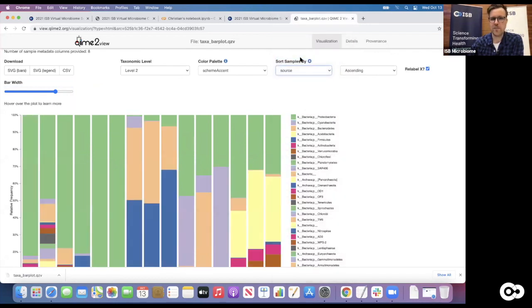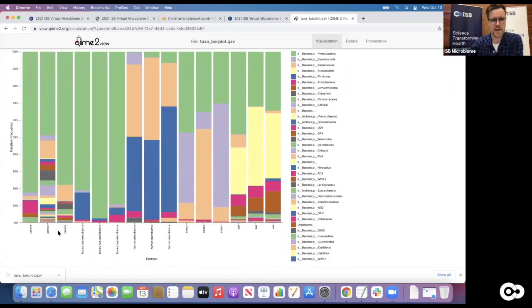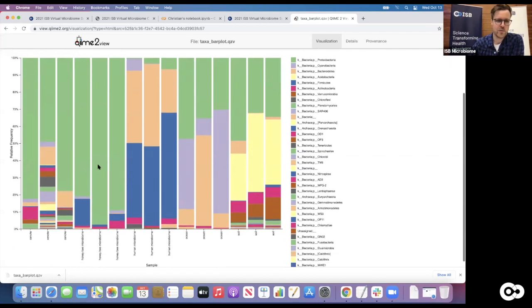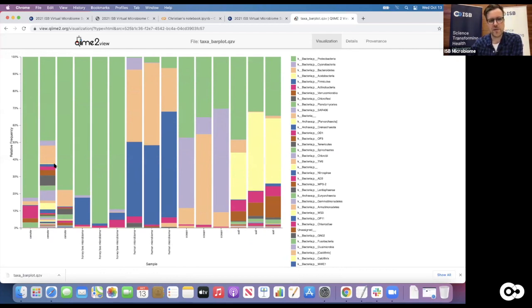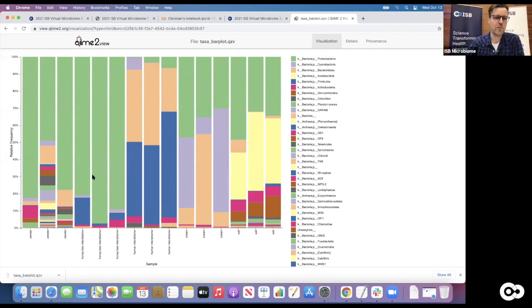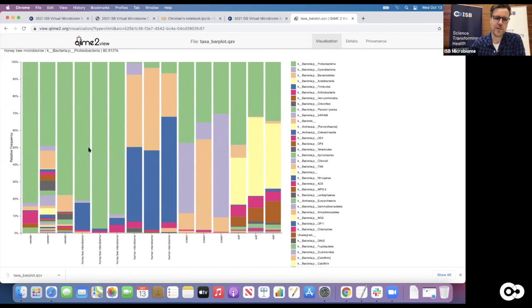We also have the ability to sort samples by environment using the metadata. Now we see the cenote samples from Mexico - they're fairly high in Proteobacteria, and at least one cenote has a massive diversity with many phyla you don't usually observe - that massive diversity shows up in our alpha diversity measures where some cenotes were very diverse. If you look at the honeybee gut microbiome, you see it's mostly dominated by Proteobacteria.